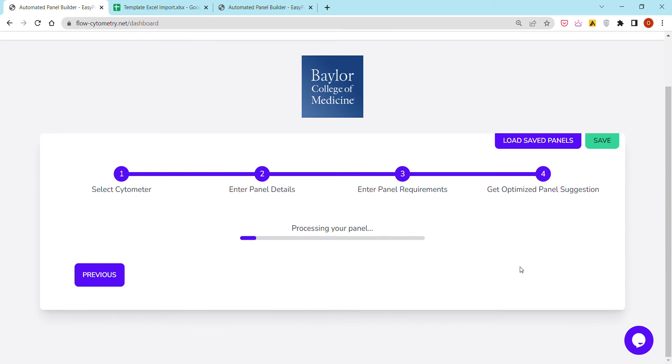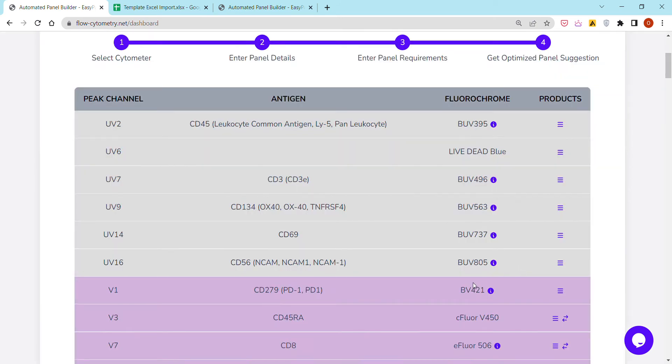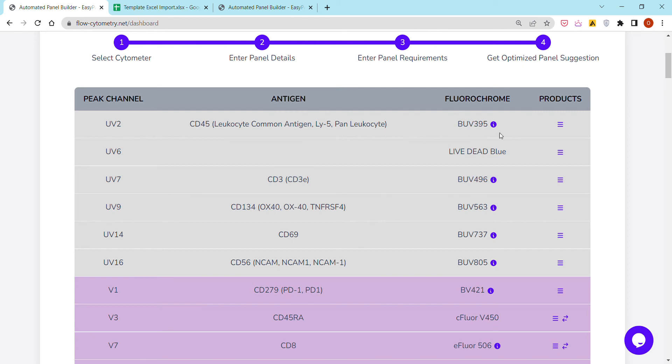We end up within the space of a few seconds, or maximum a minute and a half, getting this optimized flow cytometry panel suggestion, including the different antigens we listed and then automatically suggested fluorochromes that are optimized for each antigen. The last column features products.